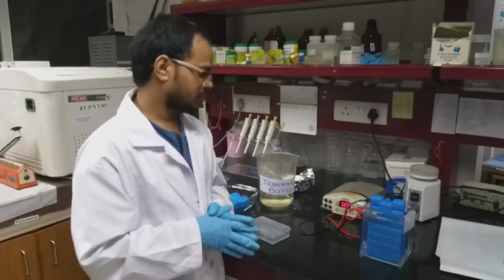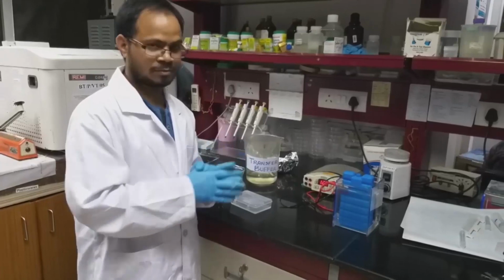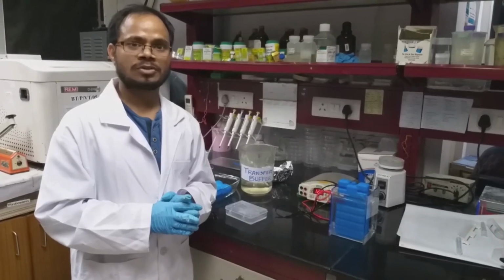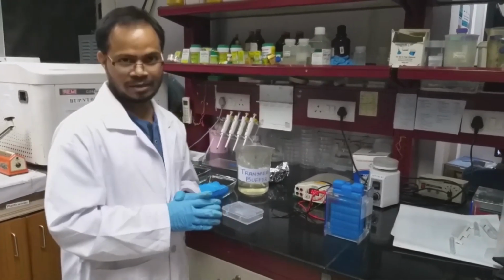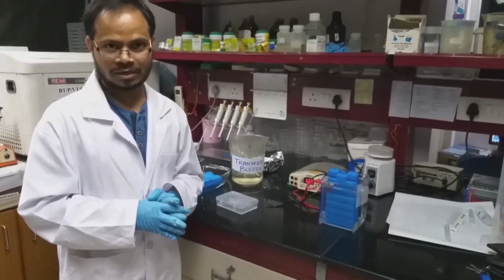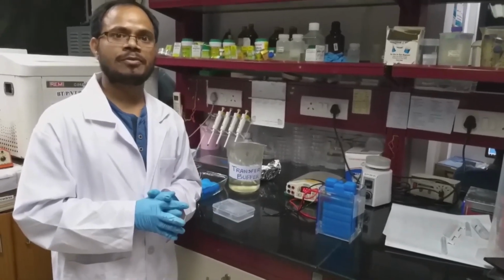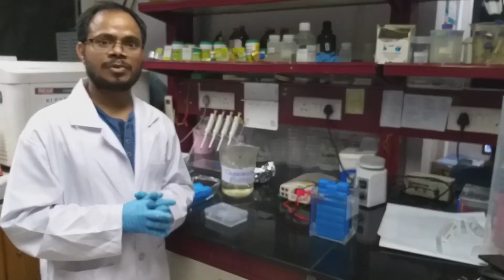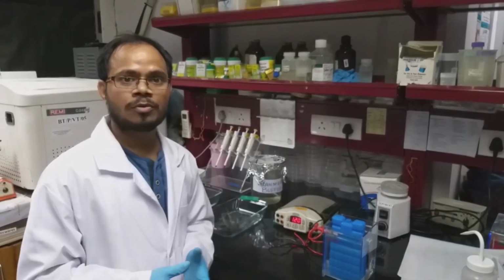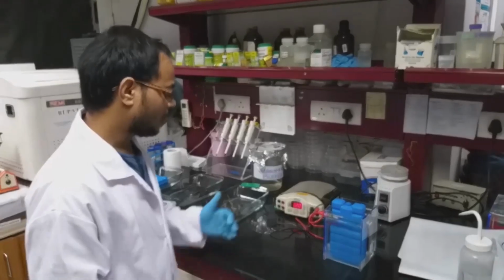Now transfer is going on. How much voltage we need to give depends on the transfer and varies. Generally in our lab we give at least 2 hours of transfer at 120 volts, which is sufficient to transfer even low molecular weight proteins. But it also varies from instrument to instrument, so you need to optimize before doing the transfer. After 2 hours, we have to remove the blot and incubate it with the blocking buffer.